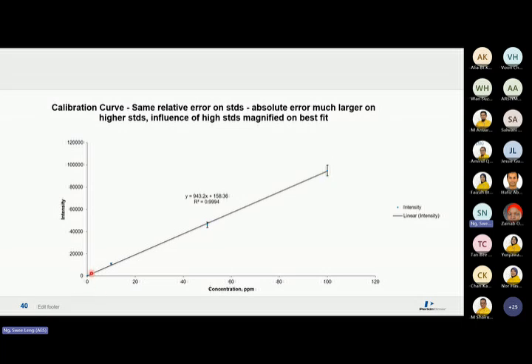So that's why if a customer runs a calibration curve of 100 ppm, and they tell me my result is 0.5 ppm, sometimes I get 0.5, sometimes I get 0. Sometimes I get 0. I say, yeah, I expected this reading to happen because of the absolute error of the high curve. Actually, the power is at the high curve.